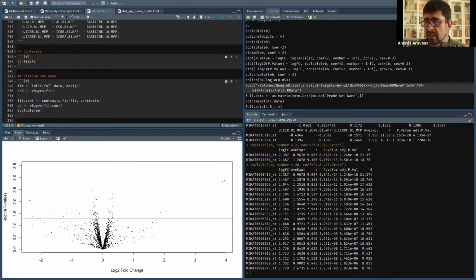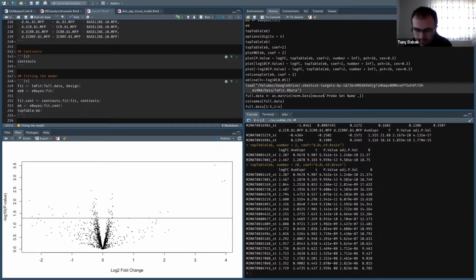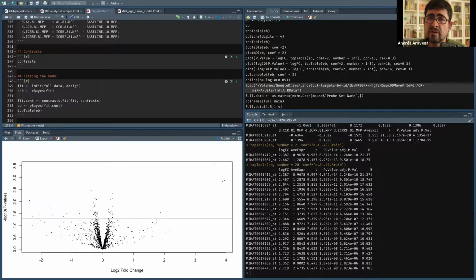The question that I didn't solve here, because it's a little more full of technical detail, is how to do contrasts with simple linear models. Because here I did everything in limma for microarray. So if you are doing microarrays, let's say that the problem is solved, except the normalization. But essentially, if you have your data normalized, I think we discussed all the theory, and we just need to do some practice. Maybe we should find some public data and ask people to do some experiment.